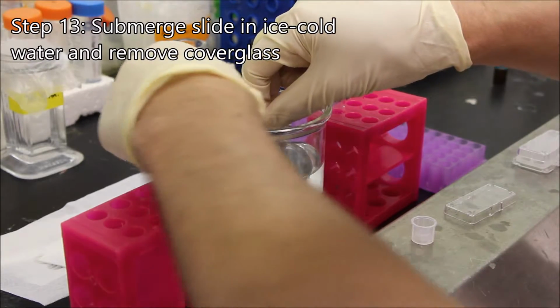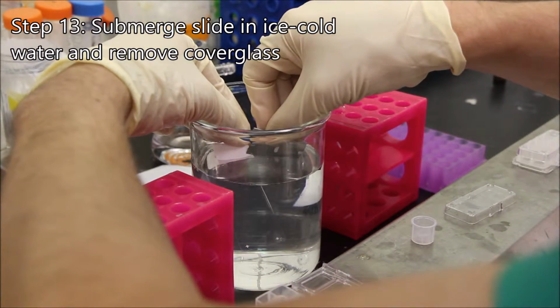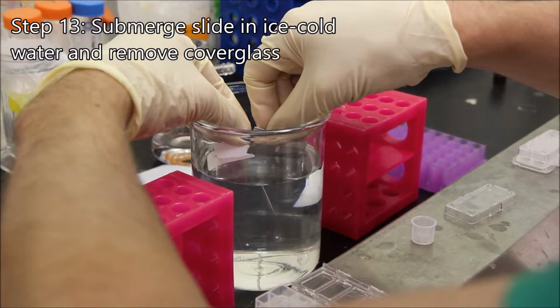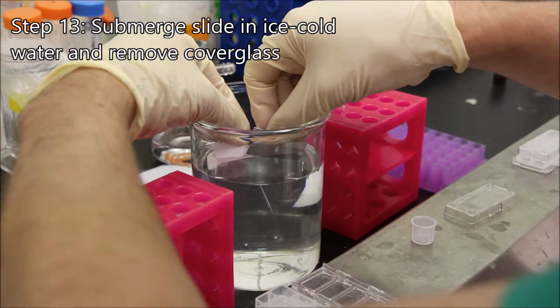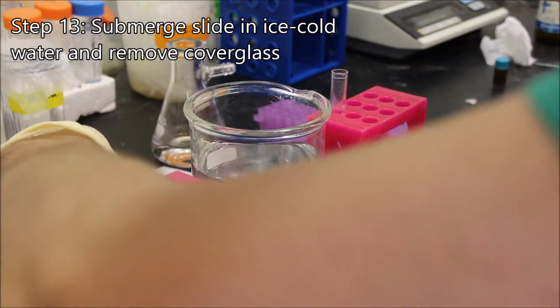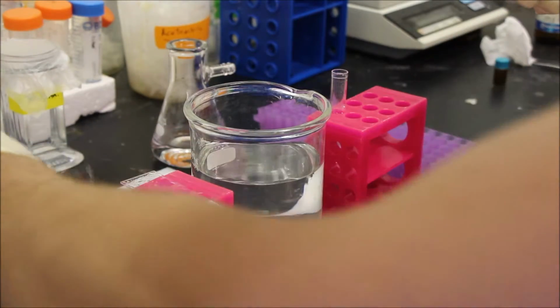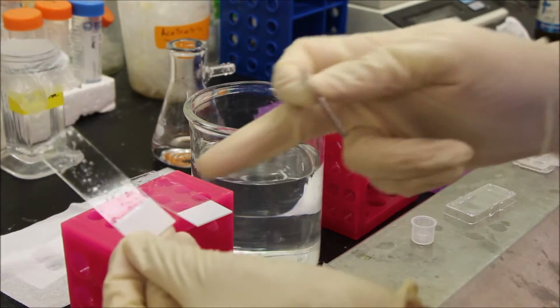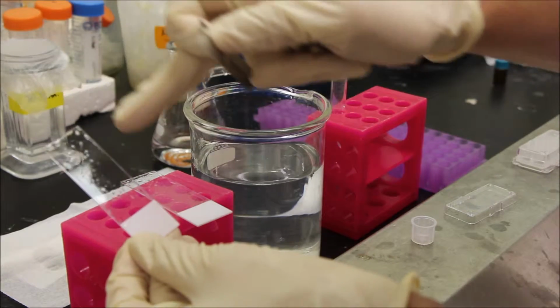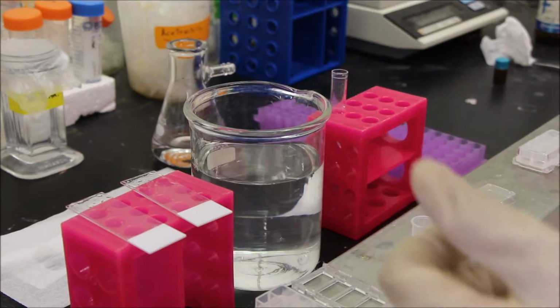So again, I'm placing it in the ice cold water, using the razor blade, and gently removing the cover slip, and drying off the bottom of the microscope slide. So now I've got two microscope slides with a nice 14 kilopascal gel on top of each of them.